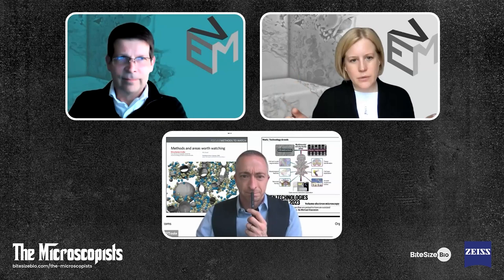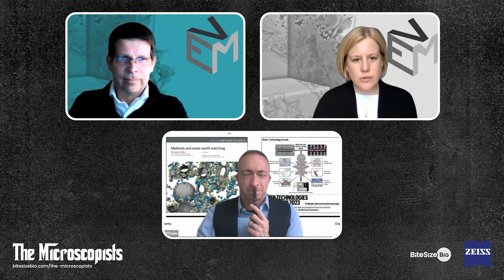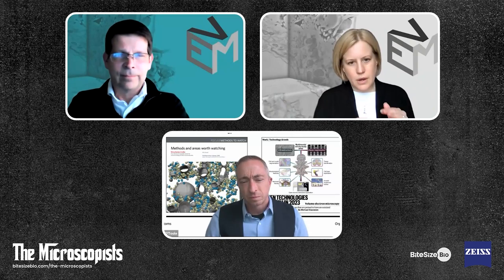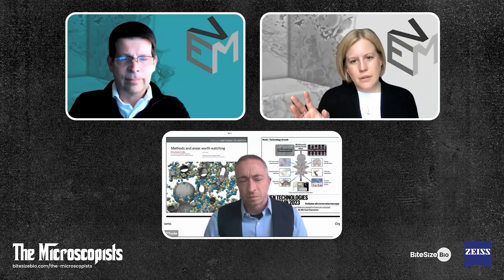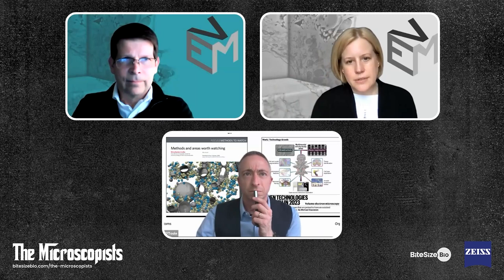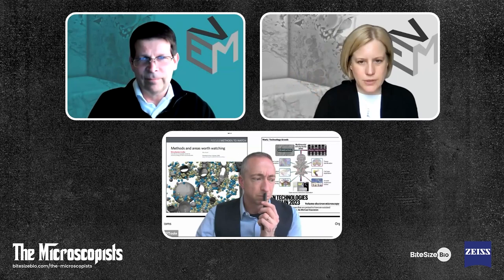But you can see in these two images, so on the left you have a Nature Methods piece highlighting in situ structural biology, and that's a fairly new field where people are imaging native protein structures inside cells using beautiful cryo samples. So all of these molecules encased in ice. And then on the right-hand side, you have volume correlative light and EM. So that's where we link, say, light microscopy with volume EM. And you have a really nice example there of spatial transcriptomics, where you can see which genes are being expressed in which cells, and the cells you can see in volume EM. And these experiments are extremely difficult, where you're really identifying molecules in the context of the structure of cells. So linking those two communities is really a grand challenge, and being able to move seamlessly across the scales, that's a tough one.